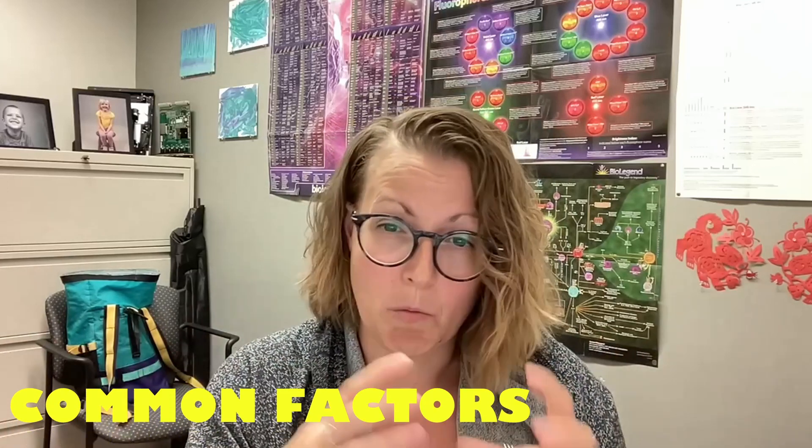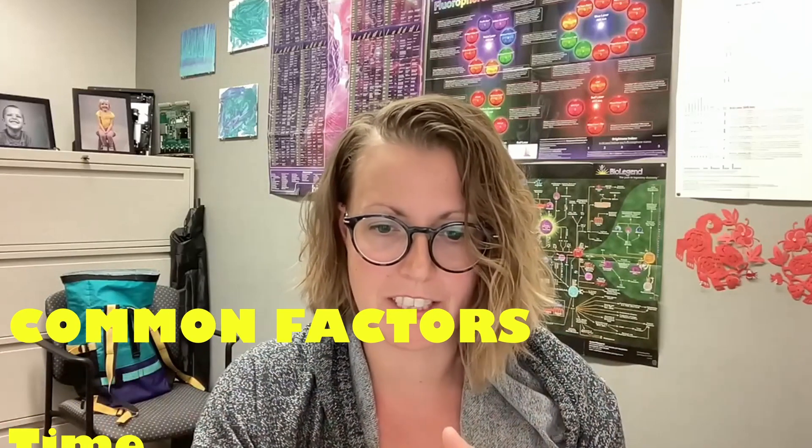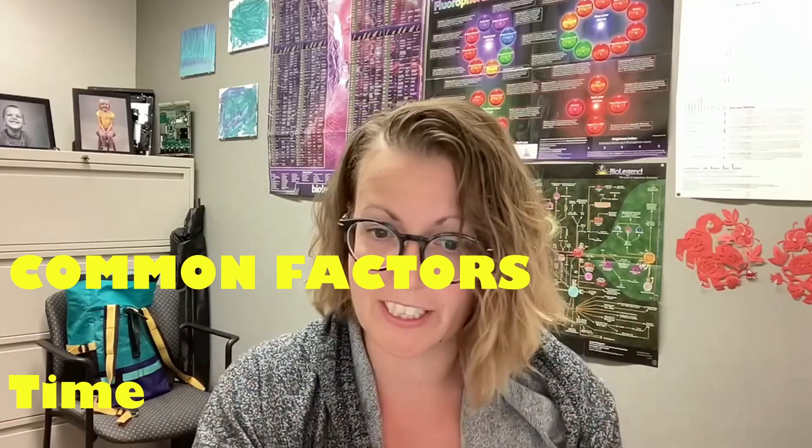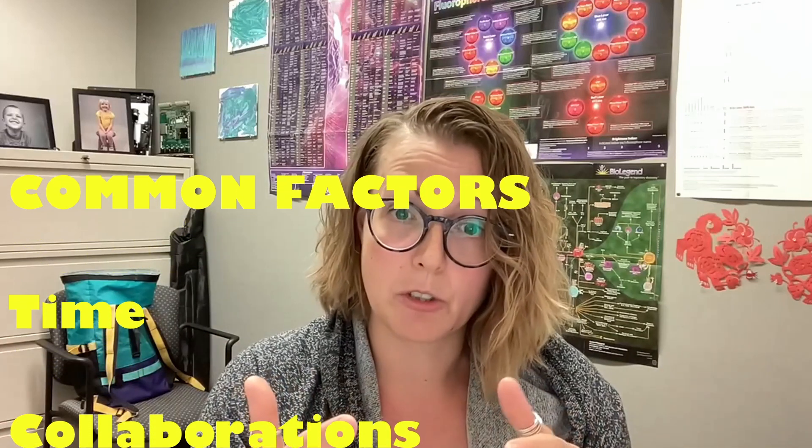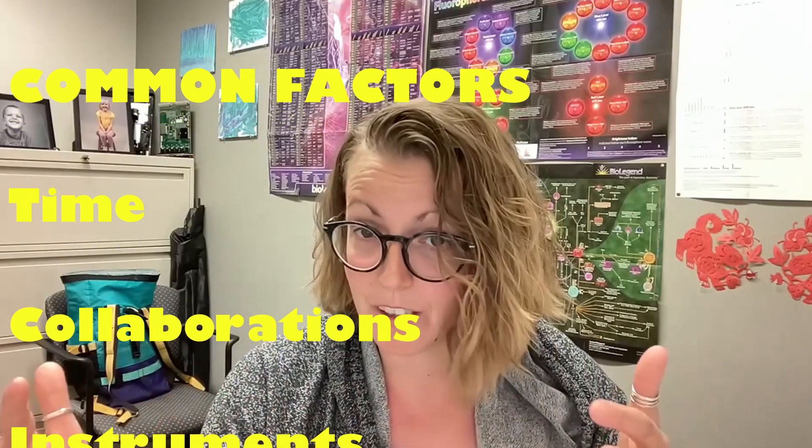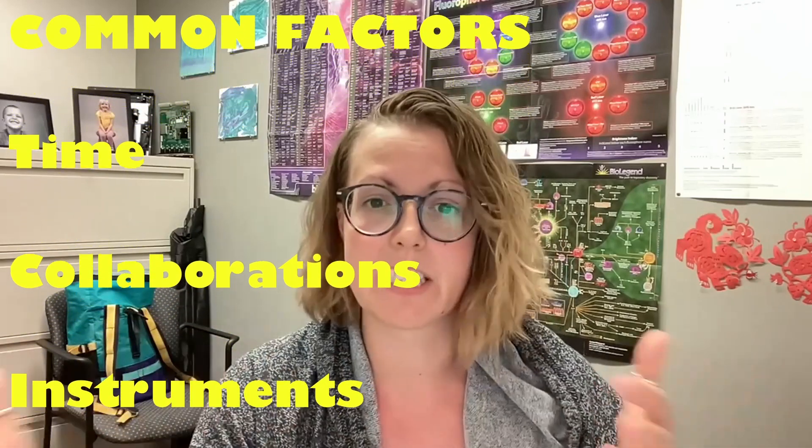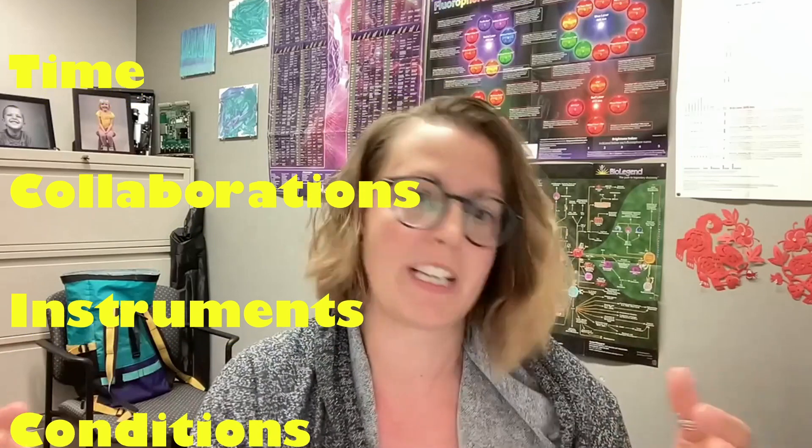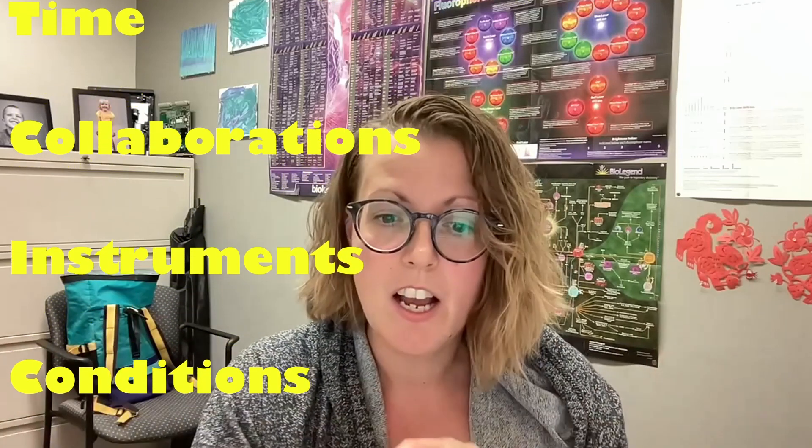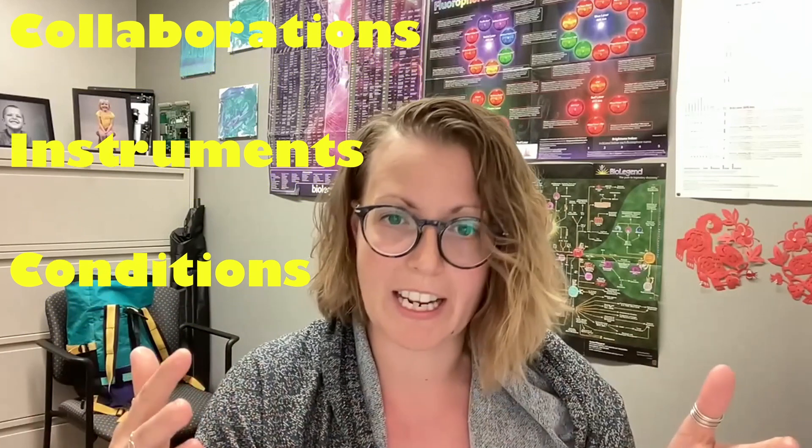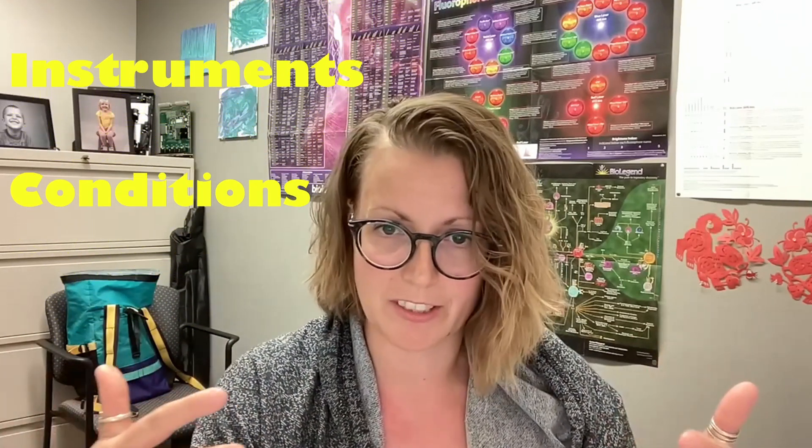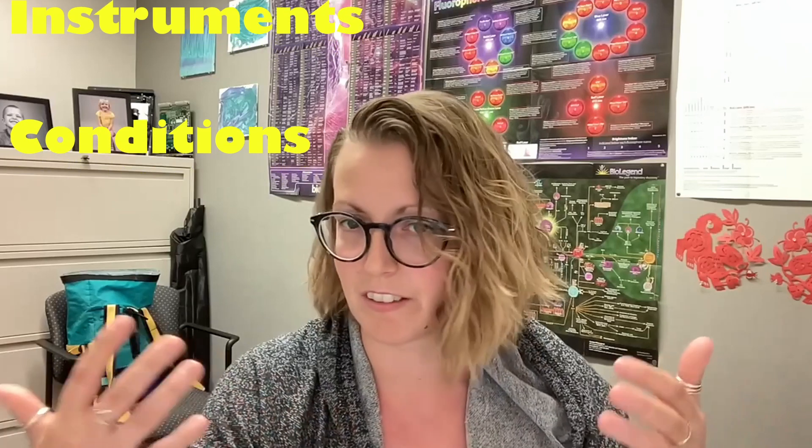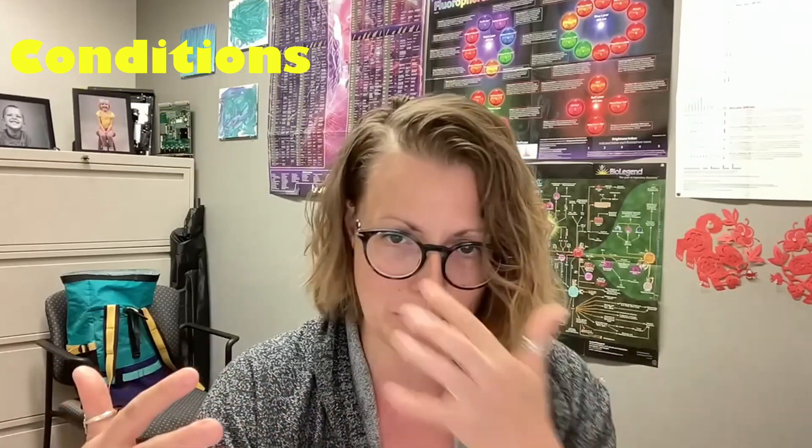Common factors that you can watch for that can create these batch effects are things like time, so longitudinal studies like I just mentioned. If you're doing a collaboration among different groups or different labs are involved you might see slight differences in the sample output just because of differences in handling. It also can be between machines if you're using different machines you might have slight differences in the data outputs just depending on the optics, the fluidics, the lasers, all of the things that change in different machines.